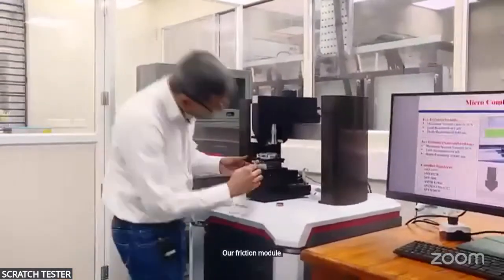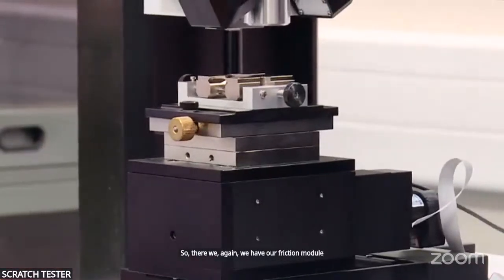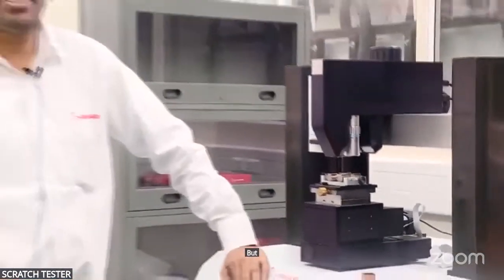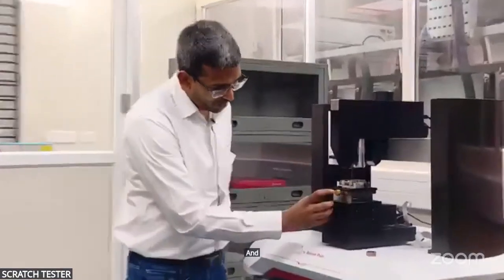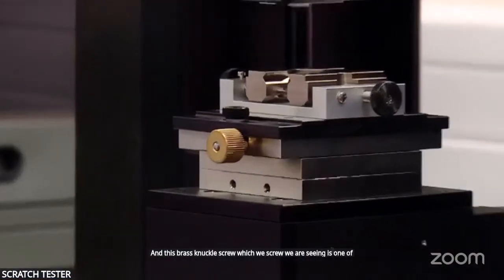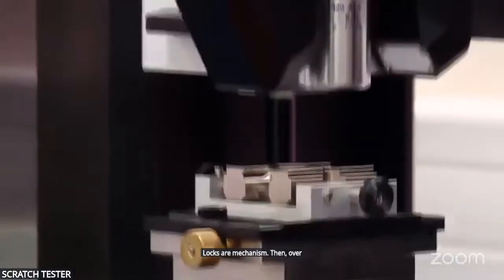Similar to there, here again we have our friction module. Here we cannot see it, it's a plate here. So there we have our friction module, and we have all the data which we get there also for scratch. But when we do the indentation, we don't require the friction module. So we basically lock it, and this brass knuckle screw which we are seeing is one of the things which locks our mechanism.